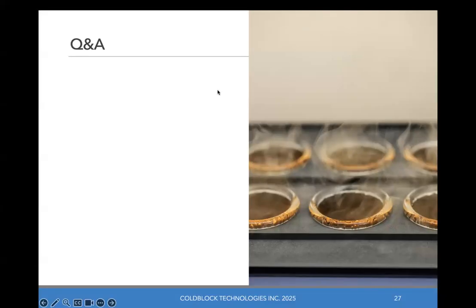Yeah, for silicate minerals, it's a question we often get asked for some of the samples that we do in the geochem side of the world. We have developed specifically a HF liner for our test tubes. Again, we're using quartz liners here for this process. We also have a plastic HF-ready liner that can be used repeatedly. That liner will allow digestions to accommodate HF. Again, with this method that was developed, we're not using HF, but other methods can be developed that use HF and that can completely digest silicate matrices.